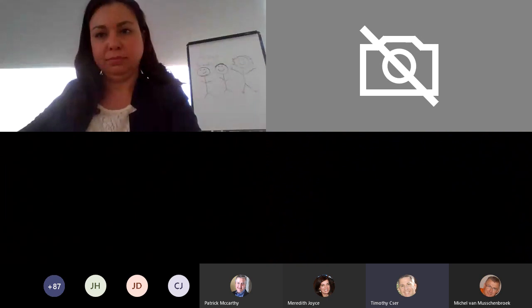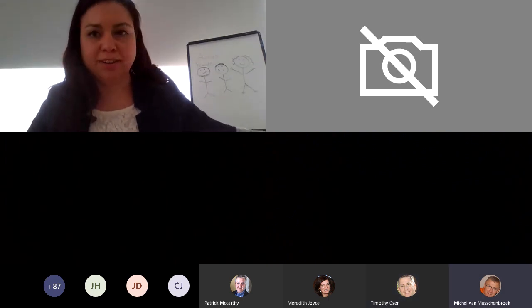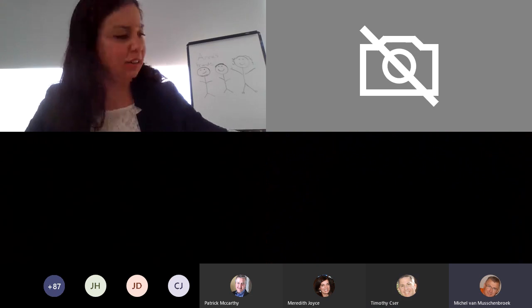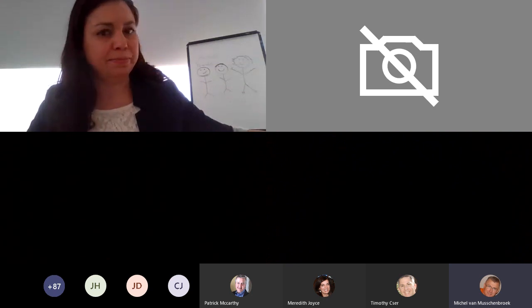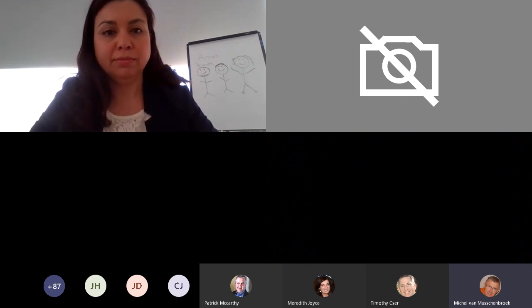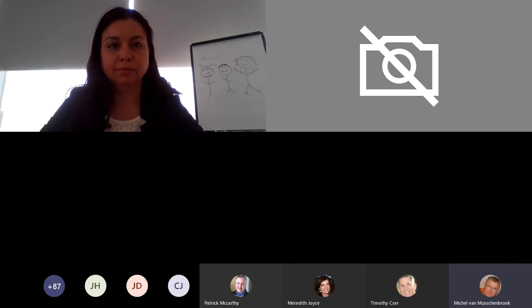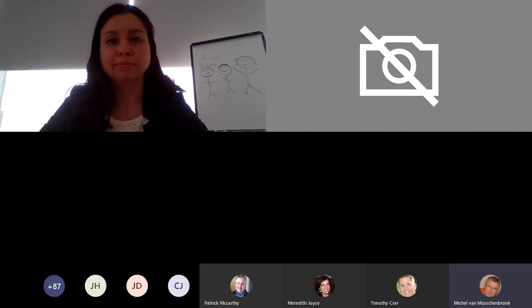Can you talk about how you can filter multiple heads with one touch? If you daisy chain three units together and place the funnels on the six heads, you can double pump, triple pump — on the one start button, all of the units will start at the same time, so that you don't have to keep pressing each one. It's just something we thought would comfort people and reduce repetitive actions.